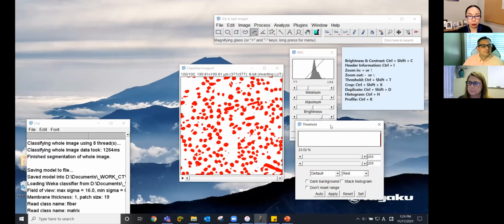You have to do the reconstruction no matter what file format your analysis software takes. When you do the CT measurement, it gives you just a whole bunch of 2D projections. That's not a CT scan yet until you reconstruct it. So you do have to do reconstruction. After you do the reconstruction, you will save it in the image format you want.